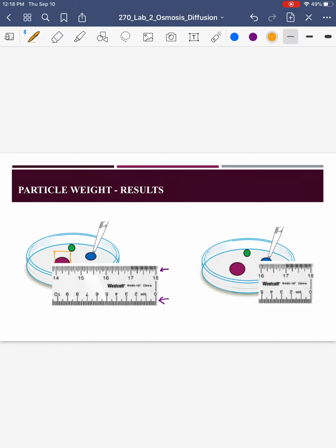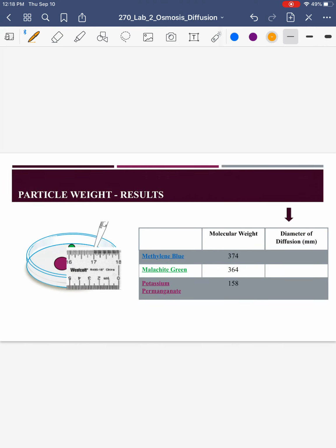Then you're going to do the same thing for the blue, okay? So you're going to get some numbers that'll look like, I don't know, 0.4 of an inch or something like that, okay? And then you can do the last one here. I've lined up the green. So don't tell the science guys that we're using inches this time. Just a mistake on my part.